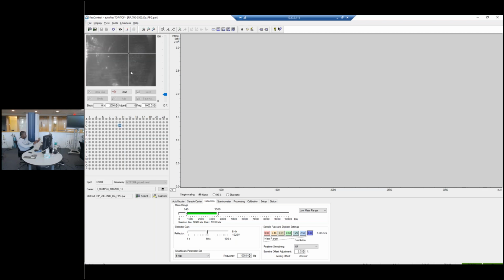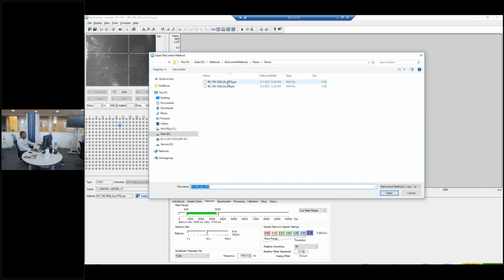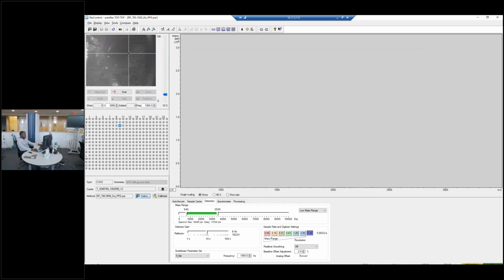As you can see, you get an illustration of the target moving inside the instrument as well. This big window is where your spectrum will be loading as you analyze it, and another window down here holds the different settings of the instrument for different samples. If you're analyzing a low molecular weight sample versus a high molecular weight sample, you'll need slightly different settings. But this is not something you have to worry about, because it all comes loaded in the different methods that carry all that information.